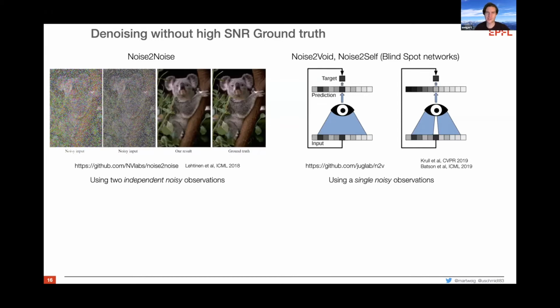So typically if you add synthetic noise to images, it's super easy for a network to learn what is Gaussian noise and what not. And this is not always present in real noise, right? Real noise is not always perfectly Gaussian, and it's not always perfectly shot noise or Poissonian noise. If your noise model is too simple, then a network will be able to learn textures, characteristics and correlations of the specific noise model that you use, that you as a human would not be able to draw any information from, but a network would. So I would always stay away from that.